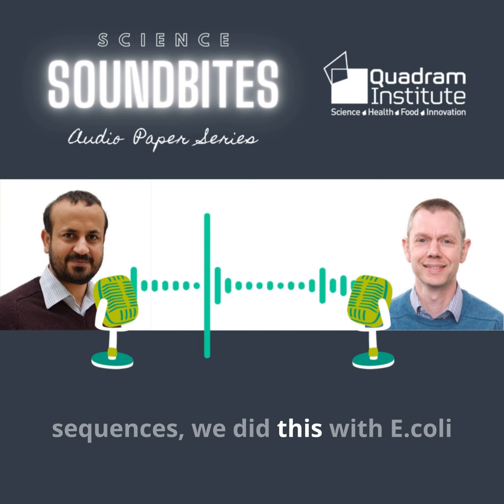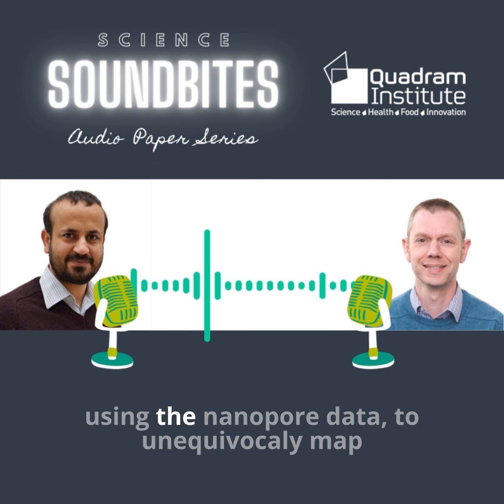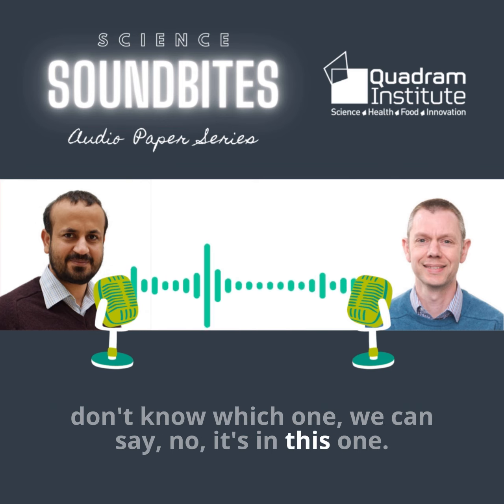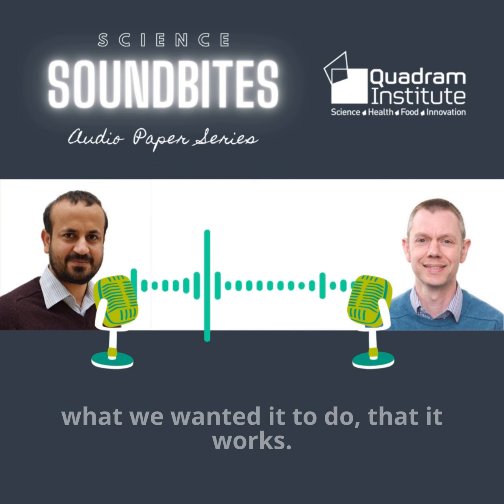We did this with E. coli in an E. coli transposon mutant library. And we found that we were able, using the nanopore data, to unequivocally map inserts to one position in the genome, rather than saying this insert is in one of the rRNA operons, we don't know which one. We can say, no, it's this one. And that gave us confidence that it's actually done what we wanted it to do, that it works.